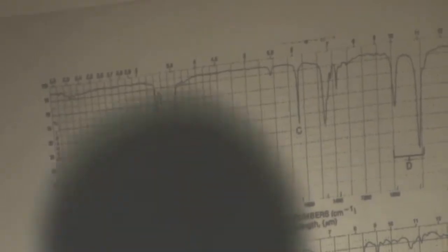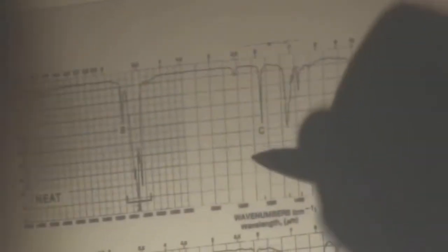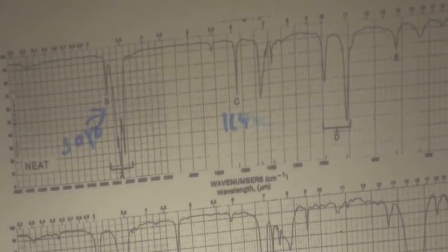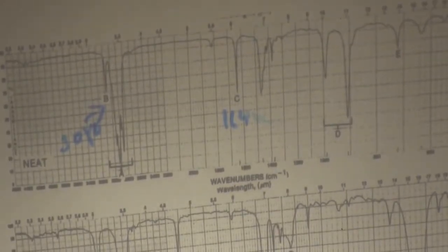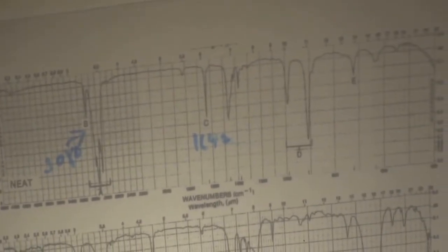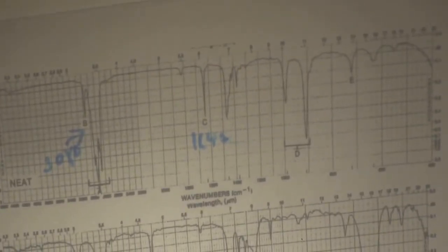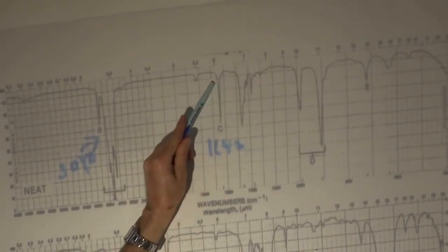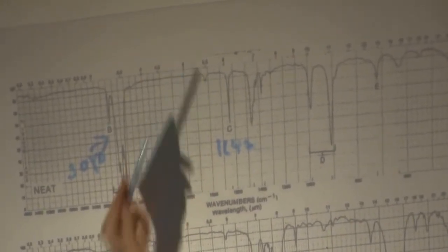So I'll just pick some numbers here. I'll just write 1642. And here we're at about 3080. Now, if I had to guess, and fortunately you will probably get other data, I'd say what we're seeing here, usually with an aromatic, you'll have a series of small, very weak bands.